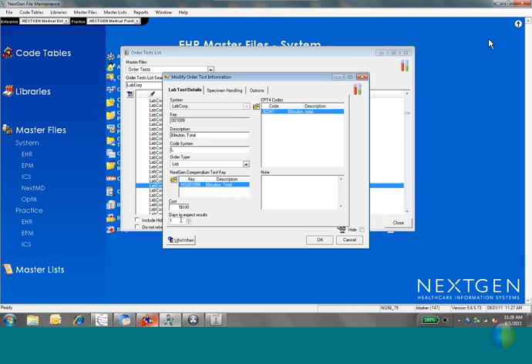Days to expect results is not currently being used by this version, so you don't have to fill anything out with that. And the notes are something that you can put internal to yourself or to your practice, but it'll never show in the orders module. It'll really never show outside of this particular entry in the table. So it's just an internal message.